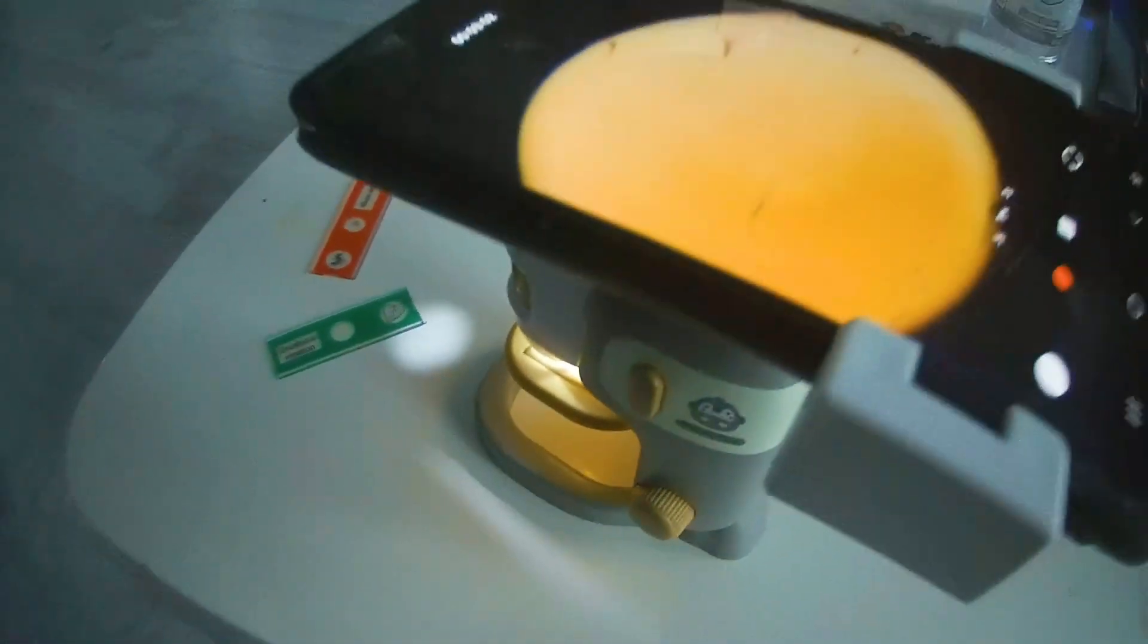Then we're going to bring this down. Now, you can basically see an ant leg. You're going to be very surprised how good of a resolution this actually is. Look at that. So that is your ant leg.